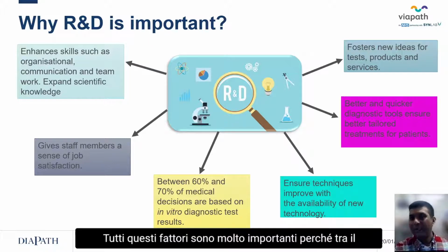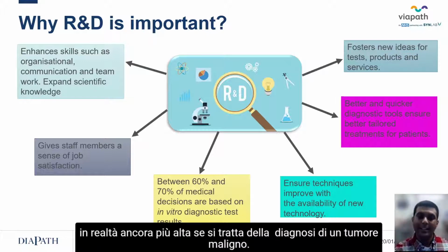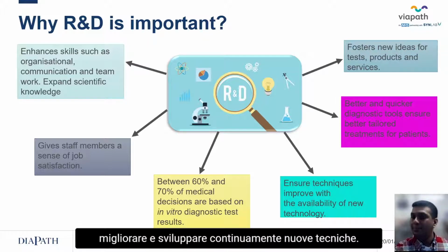All of these factors are quite important because between 60 to 70% of medical decisions are based on in vitro diagnostic test results. And this figure is actually even higher in cancer diagnosis. As a result, it's very important to continually improve and develop your techniques.